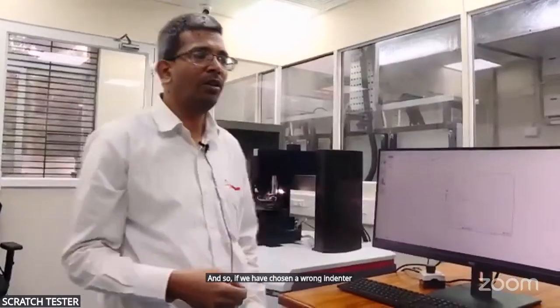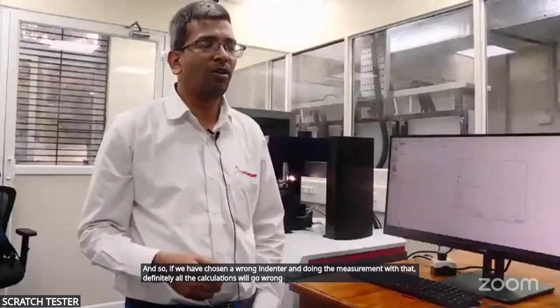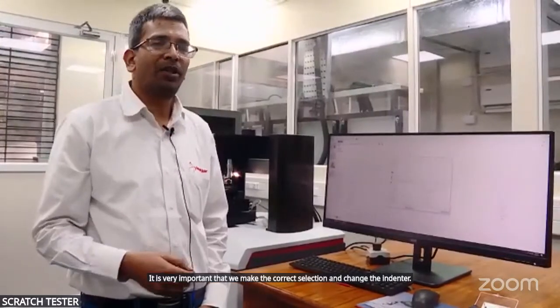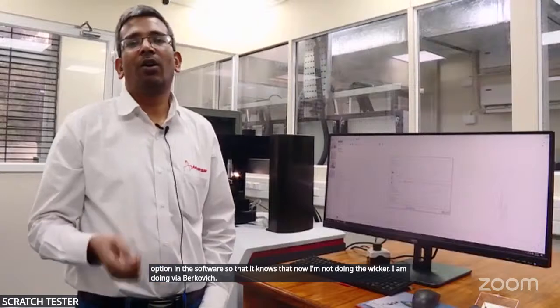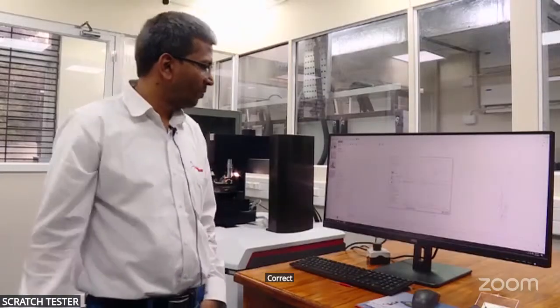If we have chosen a wrong indenter and do the measurement with that, definitely all the calculations will go wrong and we will have wrong readings. So if I am going from Vickers to Berkovich, it is very important that we make the correct selection and change the indenter option in the software, so that it knows I am not doing Vickers, I am doing Berkovich, and its area of contact will be different, so that we can get the correct values.